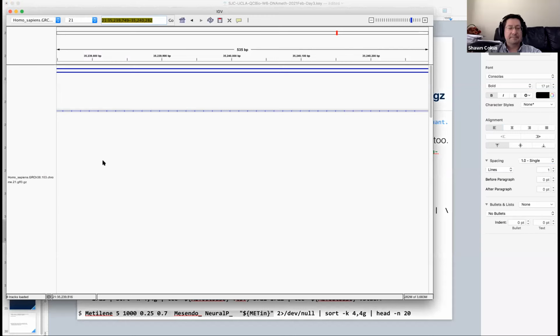Wait a second, I don't know if Ela has done something or not. I can no longer share my screen. Okay, so here is IGV.